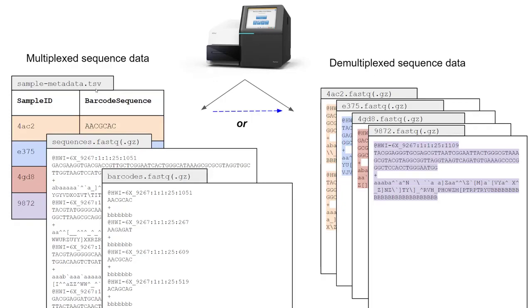But if you receive them already demultiplexed, then you can simply skip this demultiplexing process in QIIME2, and you can just move forward to the next step, which will be denoising and clustering. The easiest way to know if you have received multiplexed or demultiplexed data from your facility is by simply looking to see if you have received one FASTQ file that contains all of your samples or if you have separate FASTQ files for each sample.